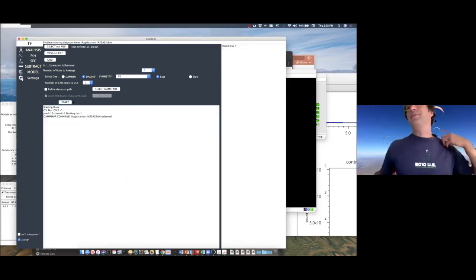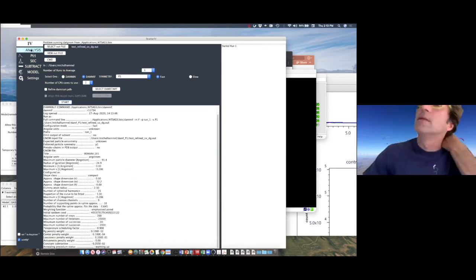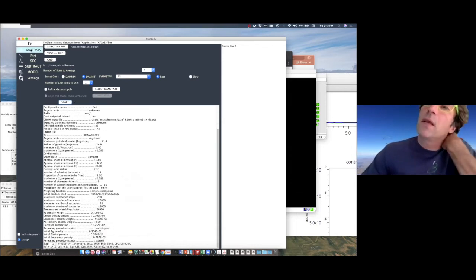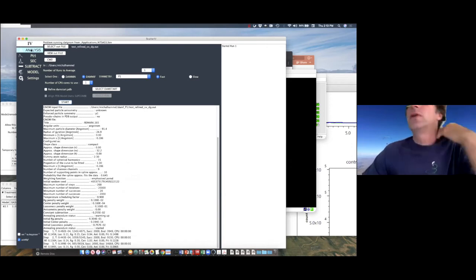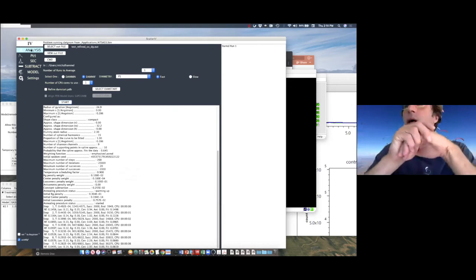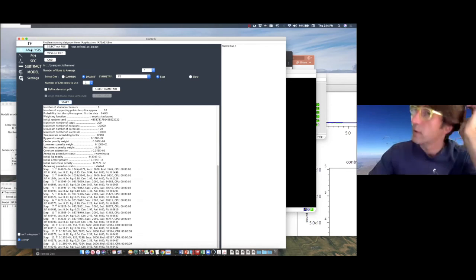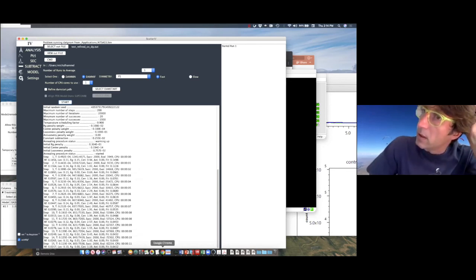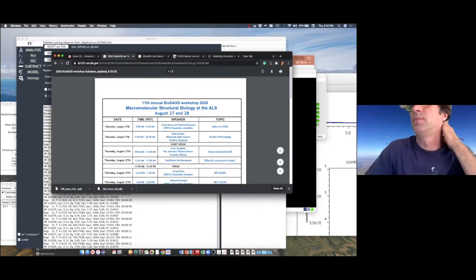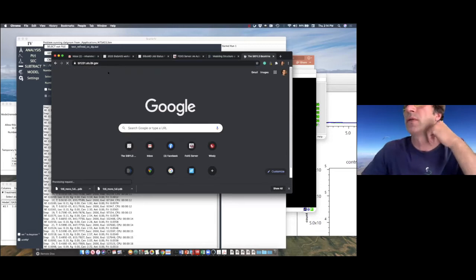So I think it's also about the way you save it. But it's a good tool when you don't want to go between these two packages and you want to stay here. We have an additional tool that you are okay to use on our server. It's part of our mission, which provides you all types of tools.